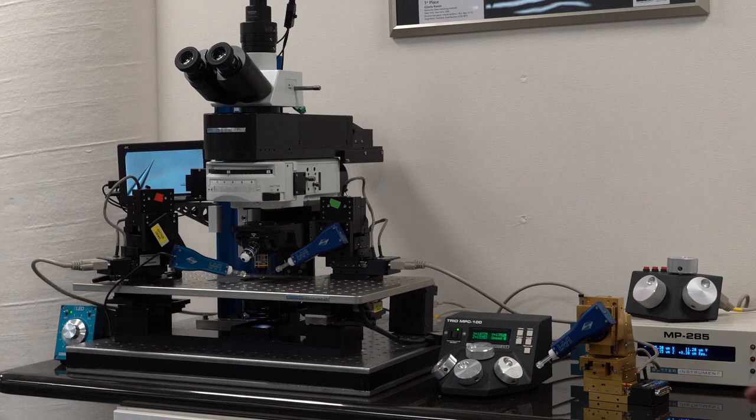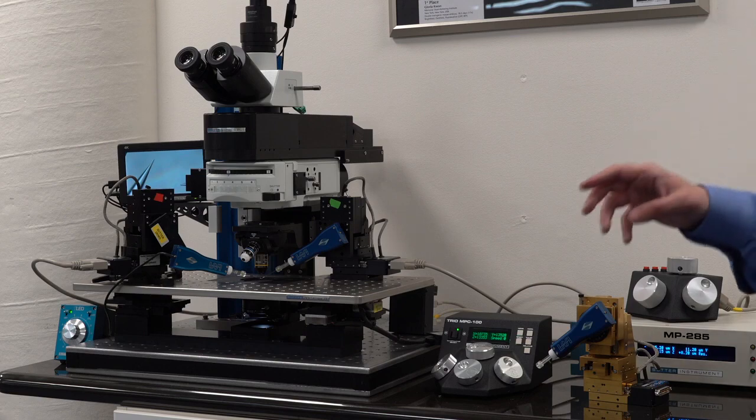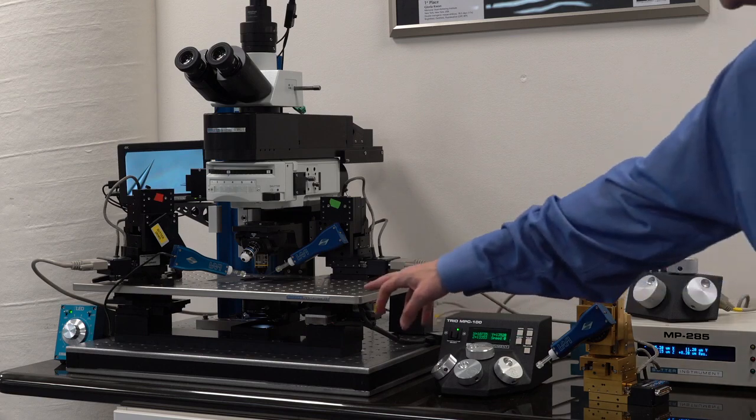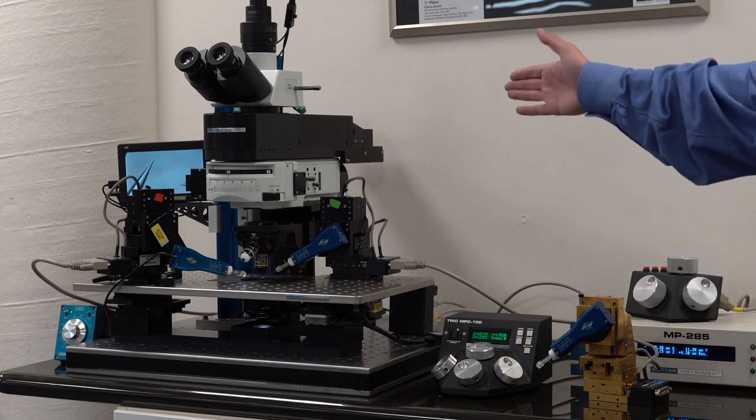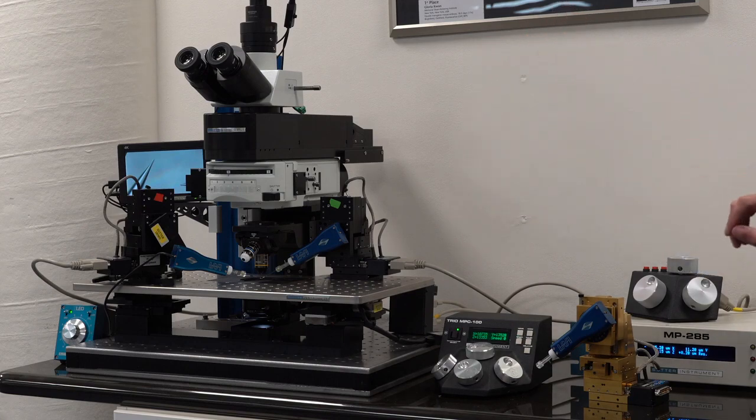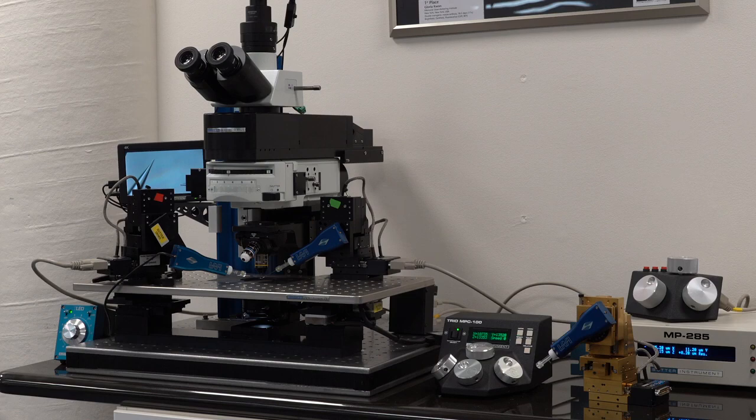So in this setup, again, because this is a 2P microscope, the 2P Bob, we have it on a motorized stage. So the stage moves because of the laser, the microscope stands still. The stage and the Z focus is controlled by our newest 285 which we call the 285A. But in this case, I wanted to show you the MPC-100.